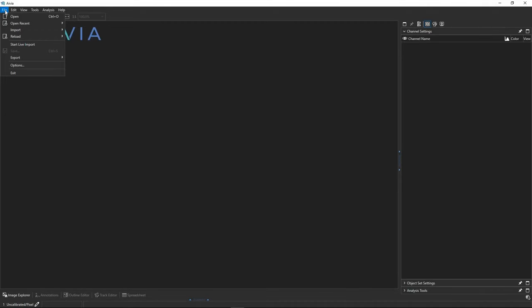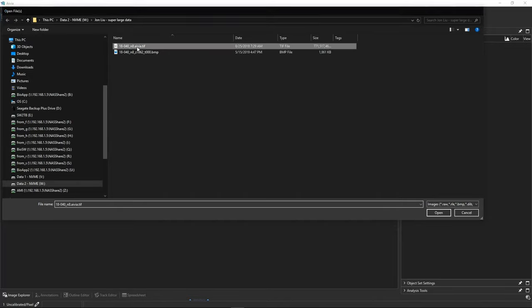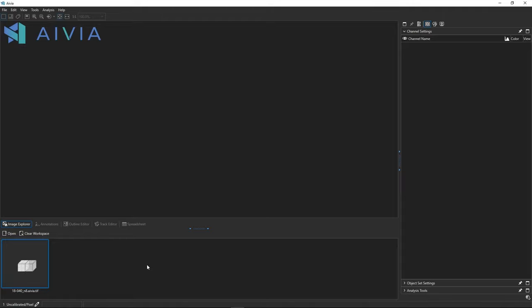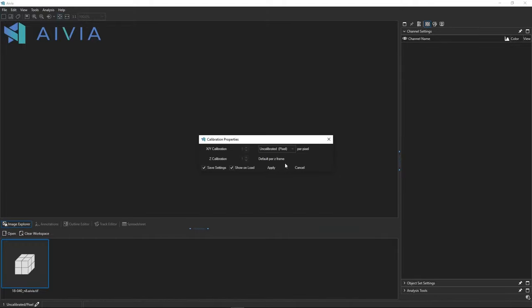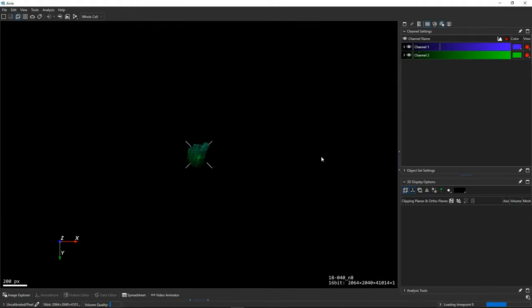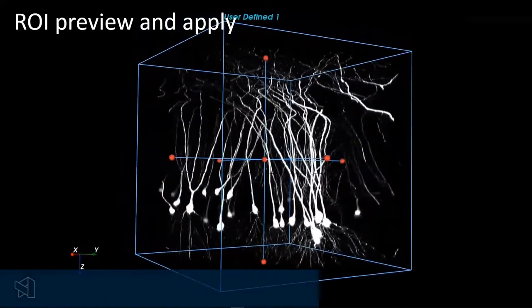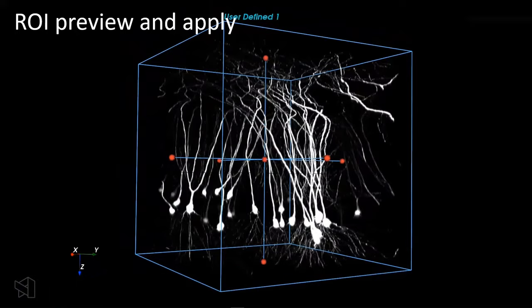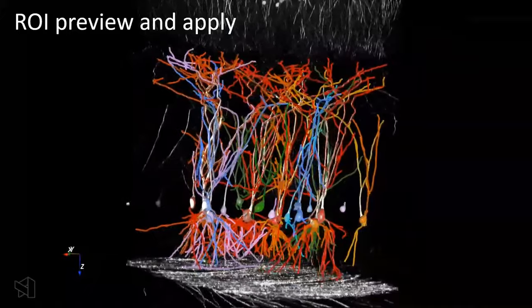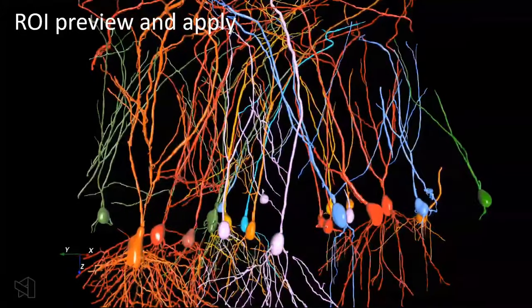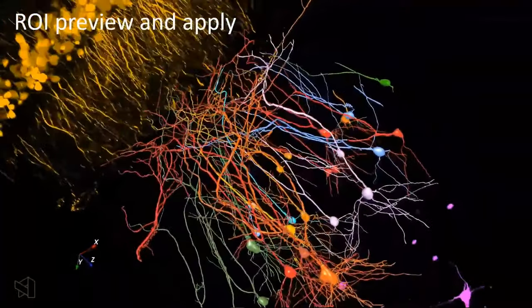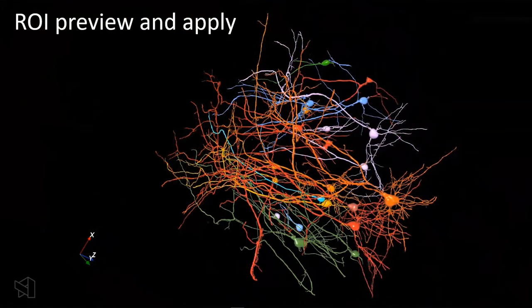Now I'm going to load the long data set — it's 0.77 terabytes on disk. It takes a moment to load but that's expected for a data set of this size; better hardware like fast SSD drives and lots of memory does help. The 3D neuron recipe — which is fully automated — has been applied in three separate regions because the parameters that work well for one region don't necessarily work well for others. That's another reason to use ROI recipe apply so each region can have its own analysis parameters.